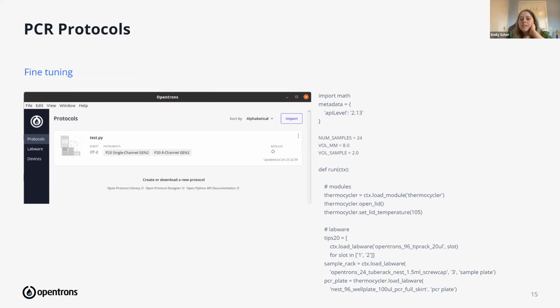But as Hamam showed before, ChatGPT on its own, from the model training that OpenAI has done on it previously, already has a good understanding of the rules of writing these protocols. So you might get something that looks okay, but because we're not doing any fine-tuning with it, it's a little bit more of a Wild West situation. You might get something that doesn't work. But that doesn't mean that in the future we won't expand this work. I just don't know at the moment.